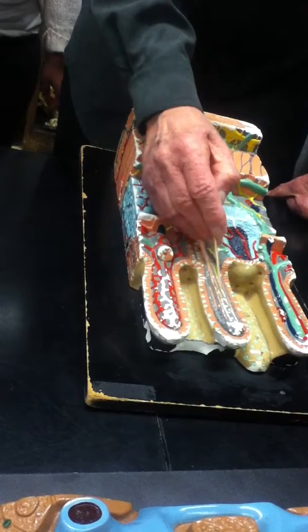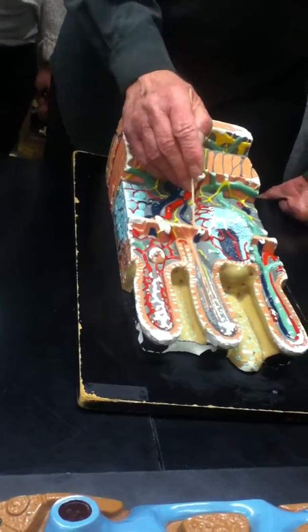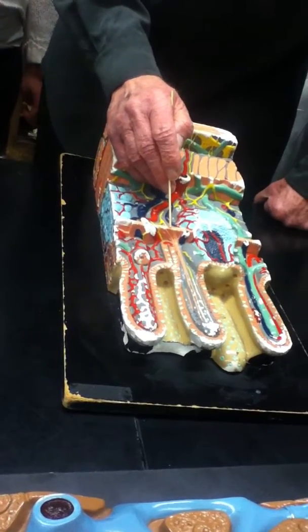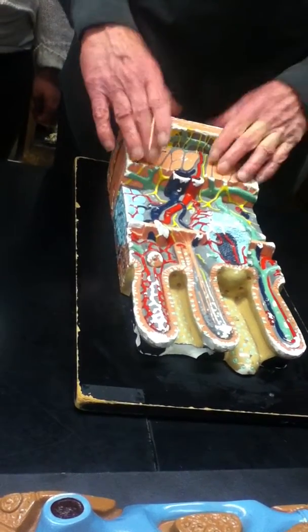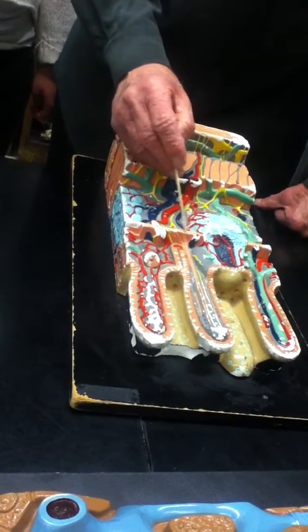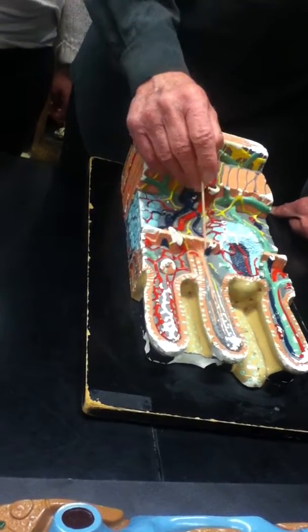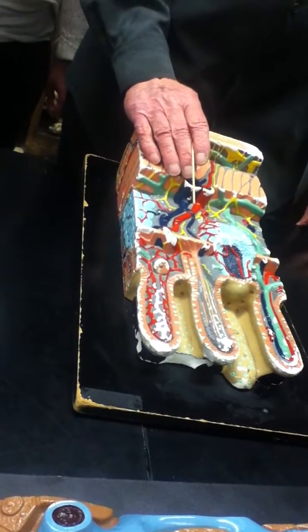What you see here, these pink lines moving up, come from this very thin muscle layer called the muscularis mucosa, because this is a muscle layer in the mucosal layer. Okay, it's not in the muscle layer. In the muscularis, it's in the mucosa. So this is called muscularis mucosa, and it sends muscle fibers up into the villi. They have a relatively important function.